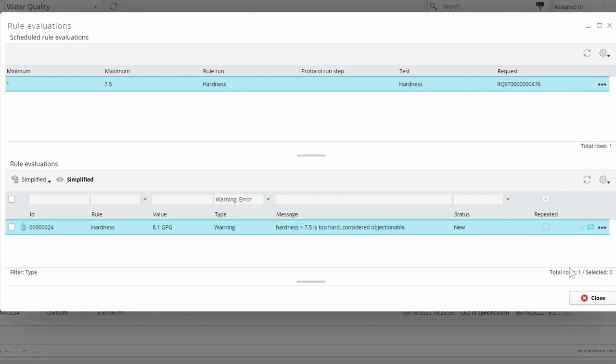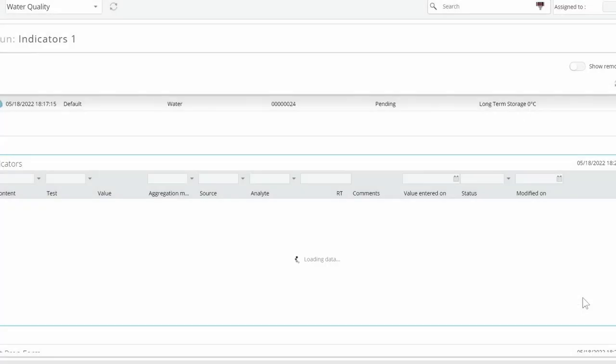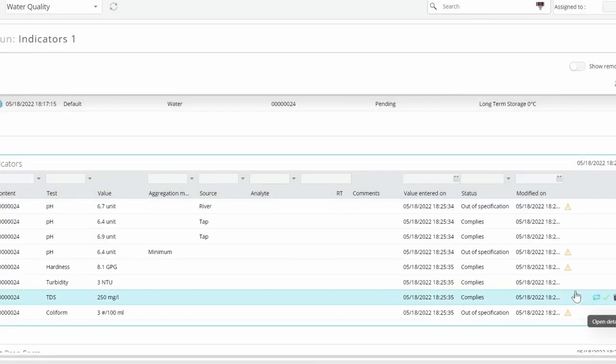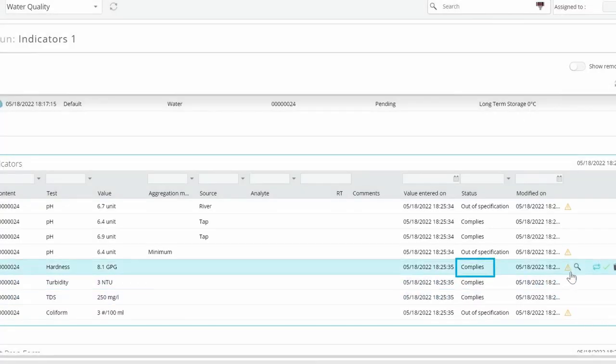In this case, it's a warning that offers advice about what water hardness is generally considered comfortable. A warning allows the result status to be promoted without validation by the reviewer.